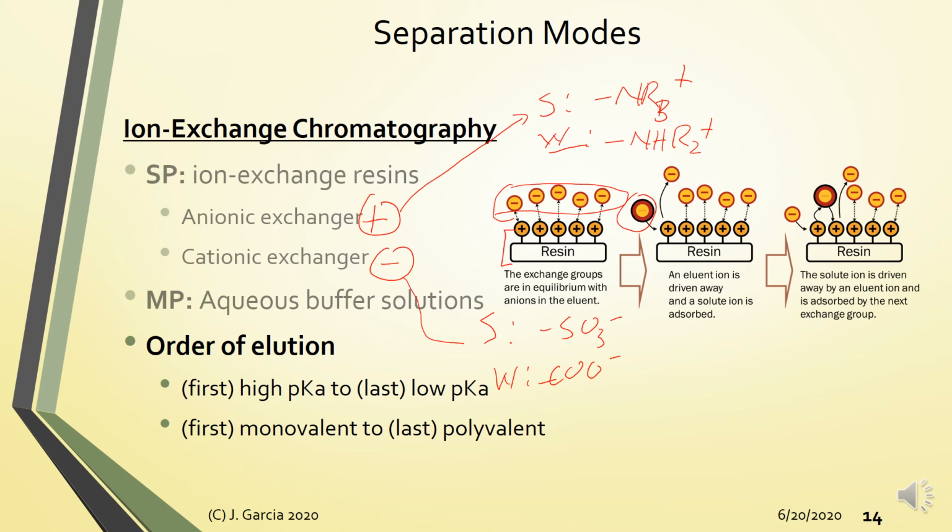For your analyte to interact with your resin, it needs to bump away the anion initially attracted to the resin. So this is what you refer to as ion exchange. So as you can see, as it goes through the column, it undergoes repeated attraction, parang ang tawag dito, repeated na pagkabit at pagkalas ng analyte doon sa resin. So series of ion exchange interactions.